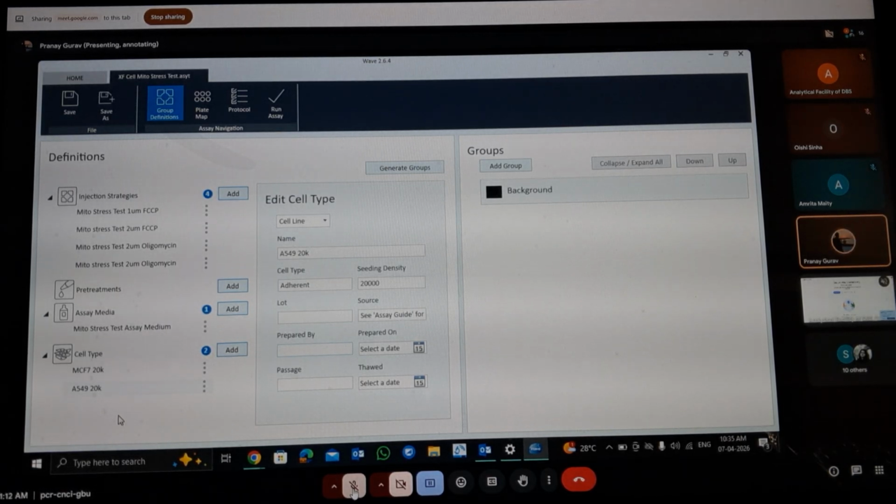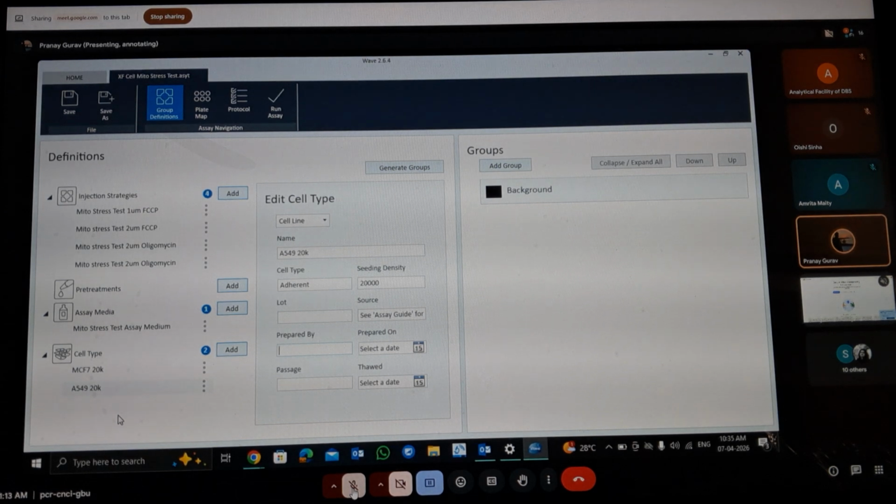Yeah. So generally when we are going to set up an assay, I would just say, if it is for 1 or 2 hours of experiment using Seahorse media, will it be making any difference in your cell line? You could see that if you are growing your cell lines in RPMI but running your assay in DMEM, it is generally not recommended to use two different medias. For two different cell lines, yes, but again, if they are grown in a single type of media like DMEM, then yes, you can do that. But if those cell lines require two different medias, then it's not right.